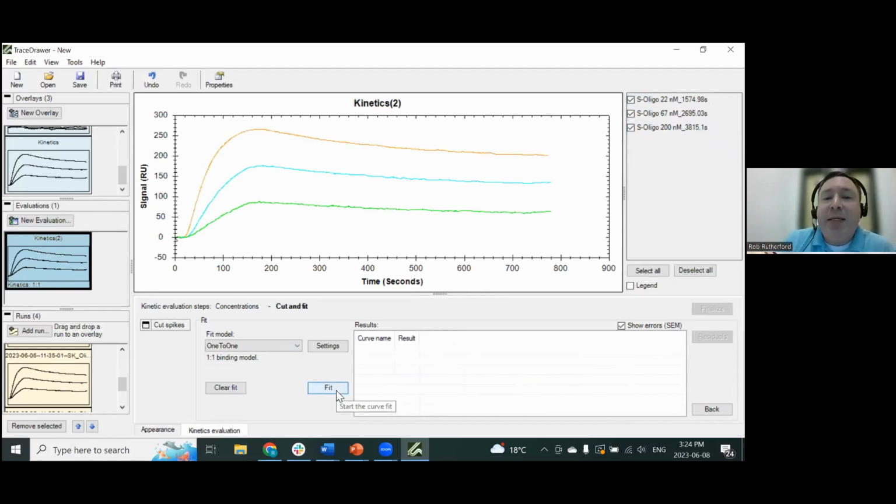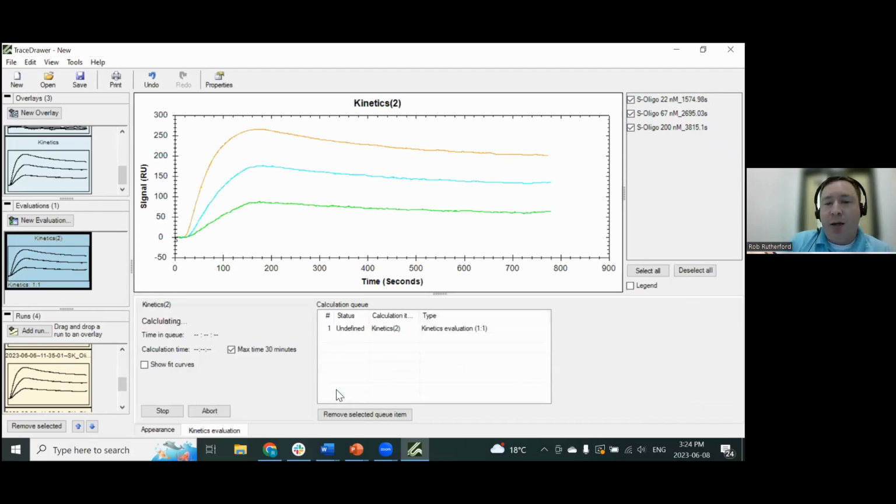But basically what we're looking at here, it took it away from me. It's fine. We'll just process it again. We want to see a fit that's fairly well overlaid with the raw data. And we want to make sure that the raw data itself has errors that are less than the calculated values, 1 order of magnitude or more, less than the calculated values that we're presenting.